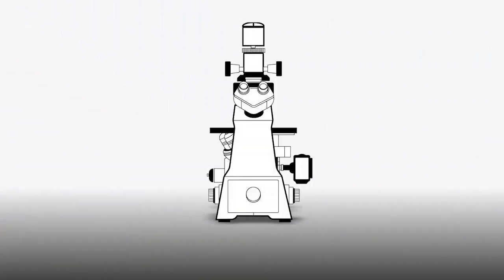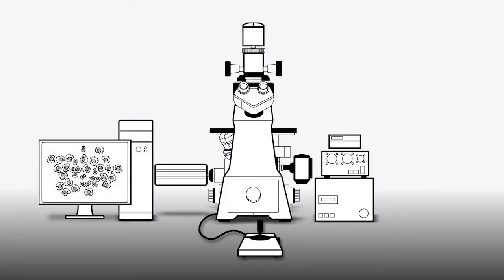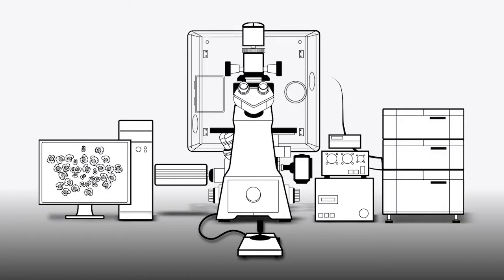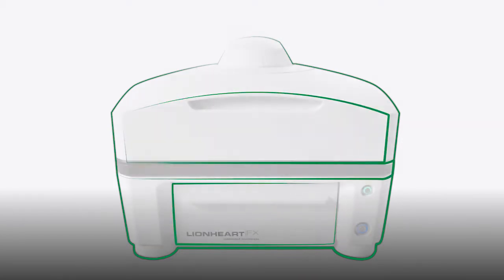Some manual inverted microscopes can be expanded for digital microscopy. However, it requires adding a camera, automated stage, and other hardware. Live cell assays add a greater level of complexity with additional components required to help maintain temperature, gas, and humidity levels. Is there an alternative to the traditional, complex, and expensive microscopy systems?